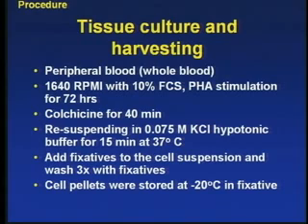After that, you add the fixative. That's the magic 3:1 ratio of methanol to acetic acid. And after that, you will do three washes. That means you take the cell suspension, spin it down by centrifuge, remove the solution, then add the fixative, and repeat this three times to clean off some of the cell debris, proteins, and other things.